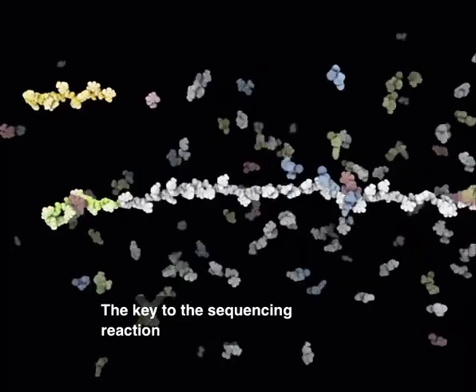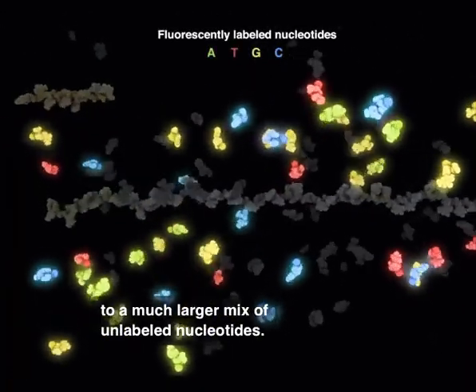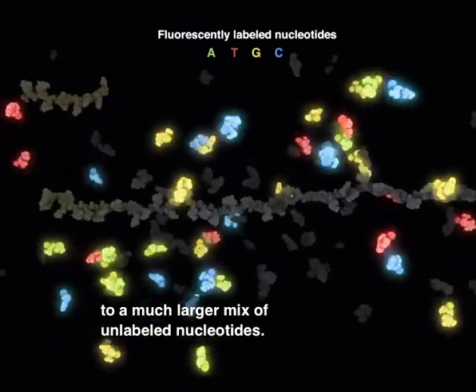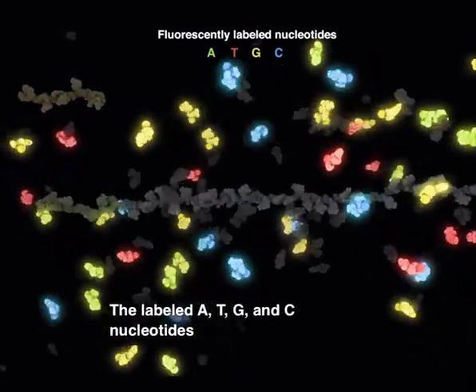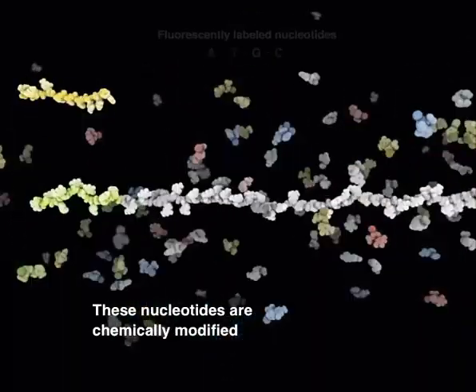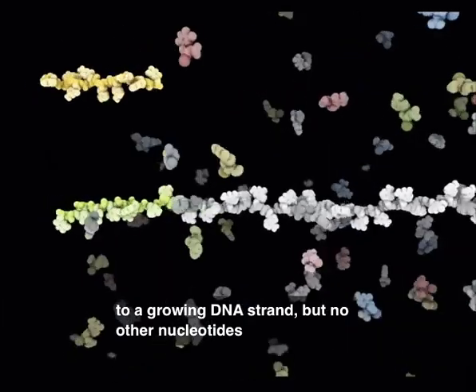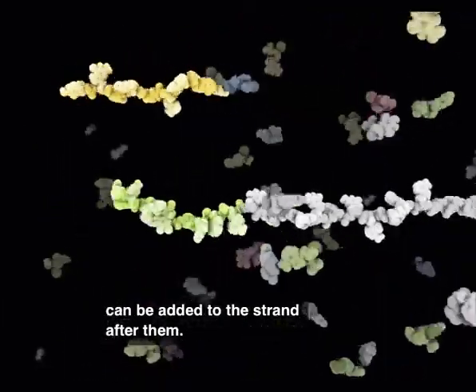The key to the sequencing reaction is the addition of fluorescently labeled nucleotides to a much larger mix of unlabeled nucleotides. The labeled A, T, G, and C nucleotides each have their own label color. These nucleotides are chemically modified so that they can be added to a growing DNA strand, but no other nucleotides can be added to the strand after them.